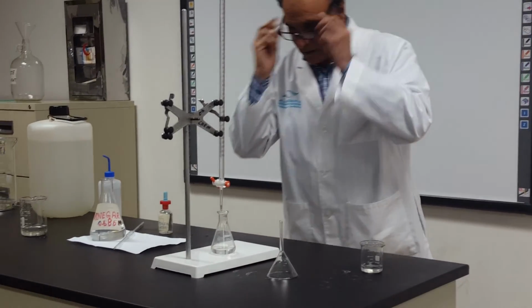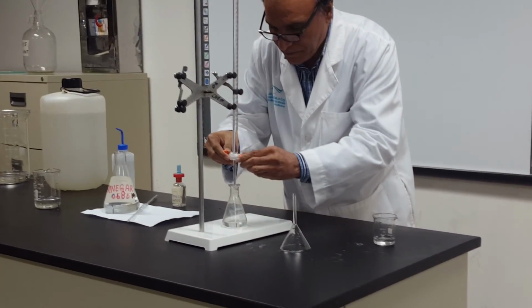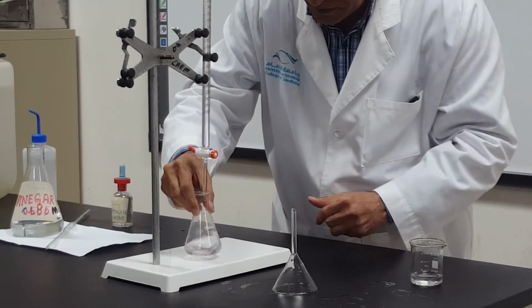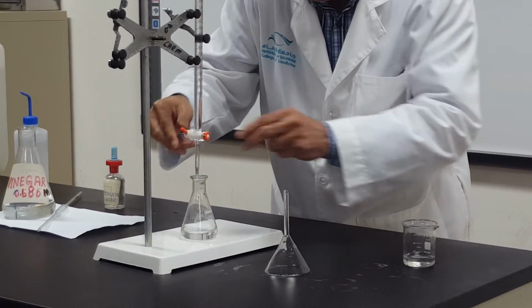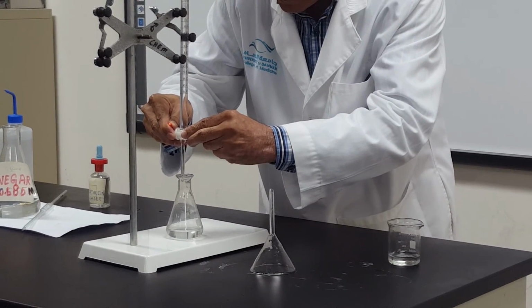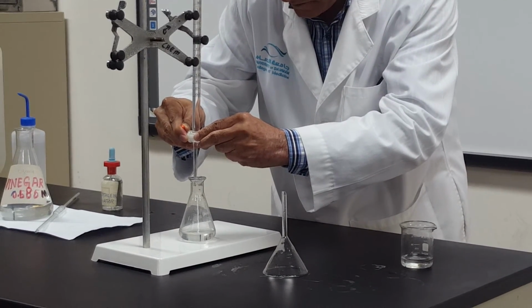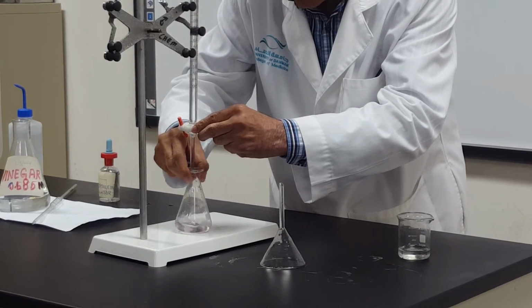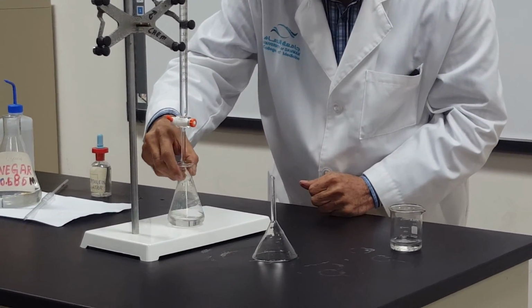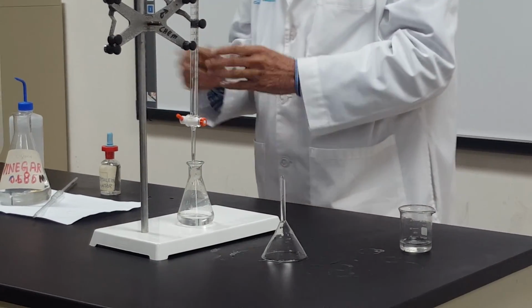And if I add a drop over here, I put 2 drops, and in fact I should put each time 1 drop. You see this one? Yes. 1 drop, and maybe I need, guess how many drops I need. It's very close.